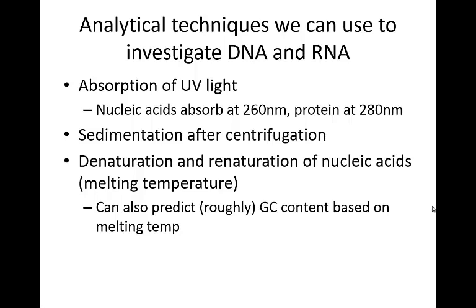There are several different analytical techniques that we can use to study DNA and RNA, and many, if not all of these, are used in molecular biology labs today in different ways. So first of all, we can use absorption of UV light.